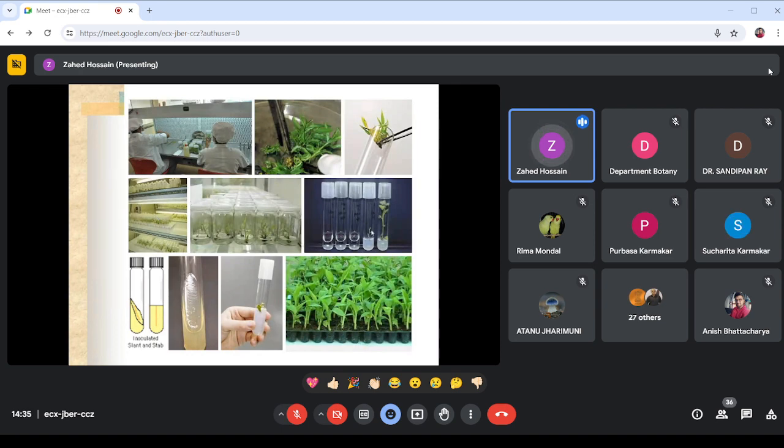And these are the different culture vessels. This is called a jam bottle, or you can say the big jam bottle. This is a culture tube, not a test tube, because here the width is much wider compared to the normal chemistry tube. Here you can find two different types of media. The first three are very clear, and the next two are a little bit foggy. In the first three we didn't apply any gelling agent, so that's why it is liquid.